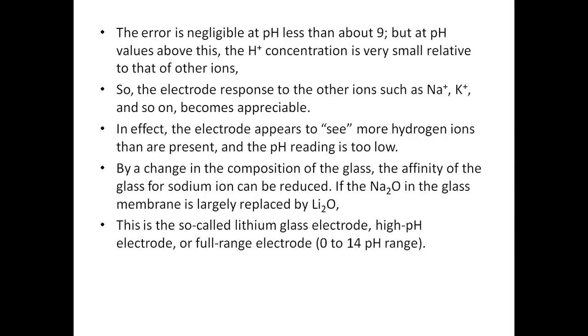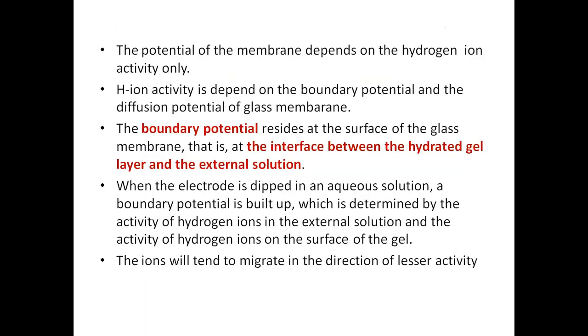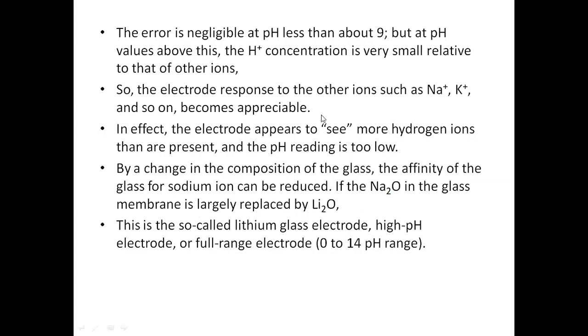it needs only the positive ion. This sodium and potassium ion also carries positive charge surrounding the glass membrane. So the glass membrane doesn't know whether this positive charge is due to hydrogen ions or sodium or potassium ions.